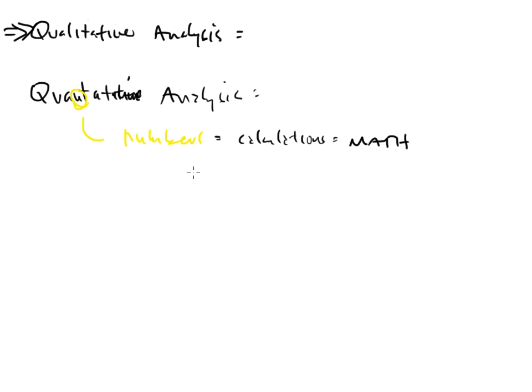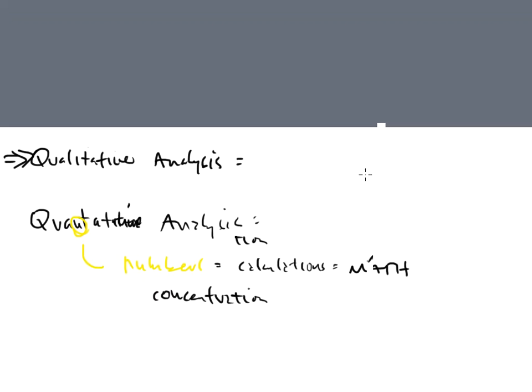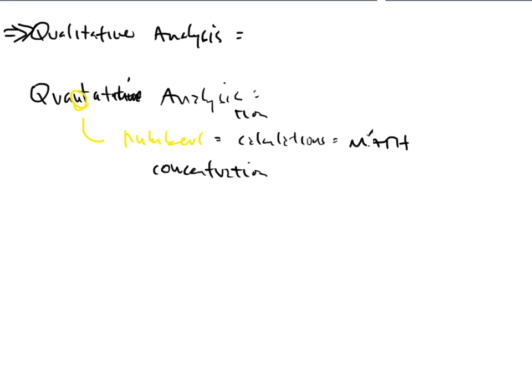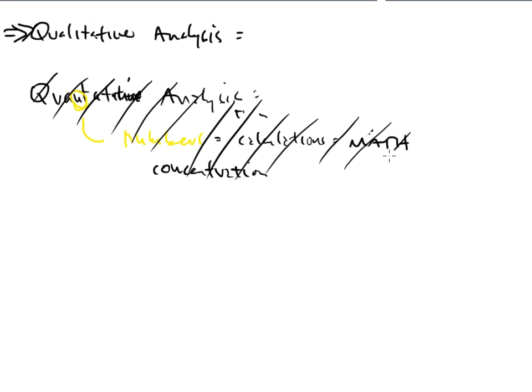So, quantitative analysis would basically concern concentration work. Concentration work meaning in a laboratory, I'm given a sample, and someone wants to know, how much is in it? And I go in and calculate how much is actually present, and I provide them a number. That is quantitative analysis. This is the field that we're not going to focus on in this lab experiment. We don't care about quantitative analysis. What we want is qualitative analysis.